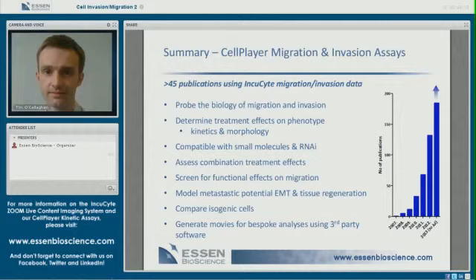So that's a fantastic question. And our invasion assays are three-dimensional assays in that the cells have the ability to penetrate the extracellular matrix and move as they wish within the 3 dimensions. However, we can only image within a single Z plane, so we can't perform Z stacks. So in that respect, the measurements are made within a 2-dimensional cell plane. But we feel that that is a very good measurement of cell invasion.